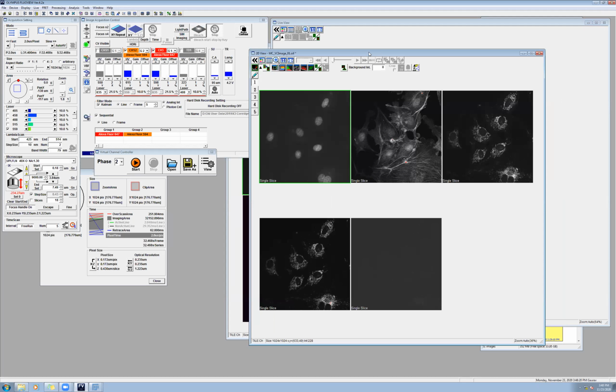So what we will do on Wednesday is I'll show you how to put the slide, some of the hardware, and then you can put your slide over there. I'll be sitting on the other side of the room and monitoring everything that you are doing. Hopefully, you should know how to work on things, but I will again go through things step by step. But it won't be brand new for you, since you saw me doing things today. And I will send this recording to you in case you want to have a look at it before Wednesday.